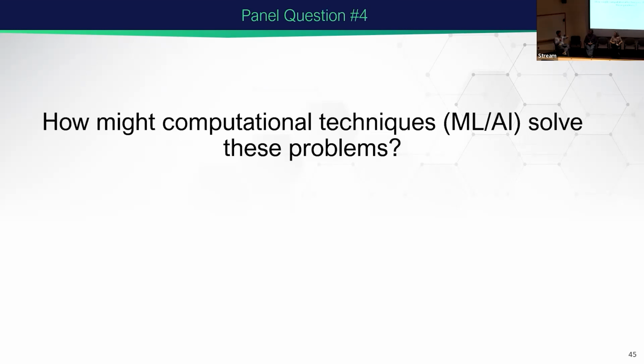One of them would be dimension reduction. There are many dimension reduction tools available, like we have seen from single cell transcript analysis and so on, such as UMAP. Some people are trying something similar for mass spec imaging data. The problem is, the best way they do it at the moment is taking each of those single pixels as if they are individual samples, and just throwing them into the reduction tool and then analyzing the dimensions. The problem is then you are missing all the spatial information, so where they are from. So that is absolutely missing right now.